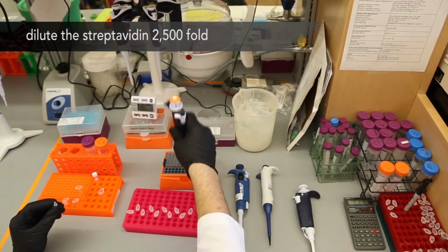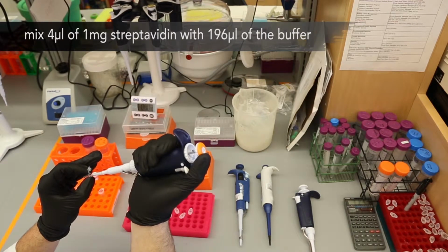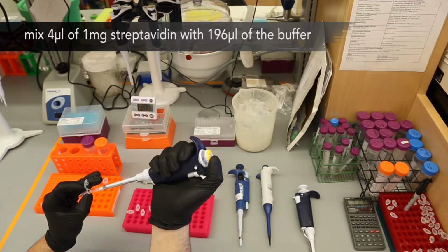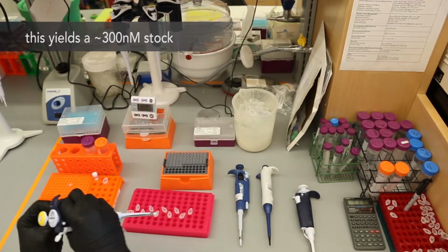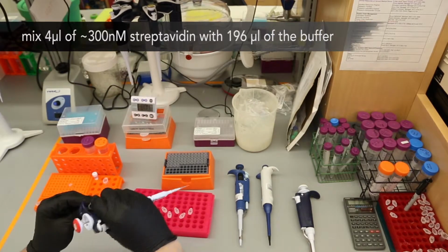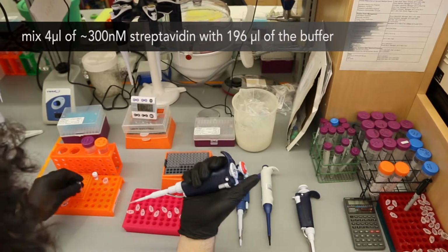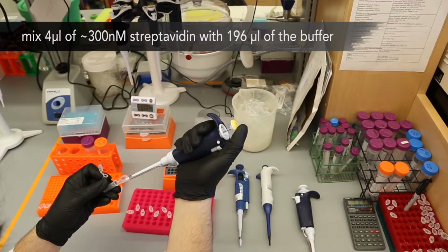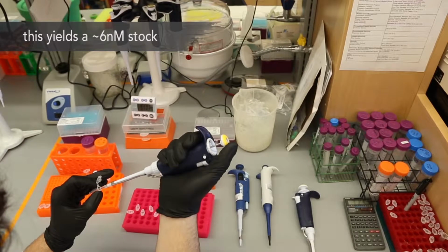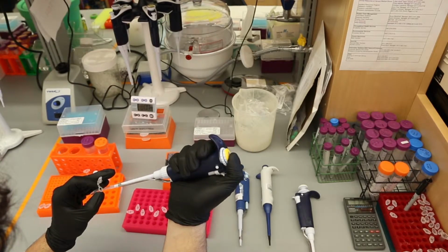Next, we will dilute the streptavidin 2,500-fold in an Eppendorf protein low-bind tube. Mix 4 microliters of 1 mg per ml streptavidin with 196 microliters of the same buffer used to dilute the construct. This yields a roughly 300 nanomolar stock of streptavidin. In another Eppendorf protein low-bind tube, mix 4 microliters of the 300 nanomolar streptavidin with 196 microliters of the same buffer. This yields a 6 nanomolar stock of streptavidin. This low concentration should be made fresh before each experiment.